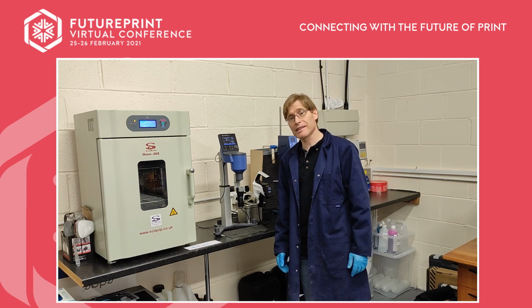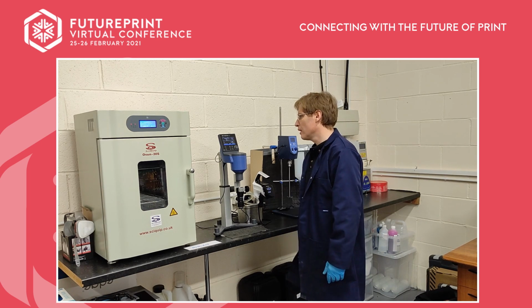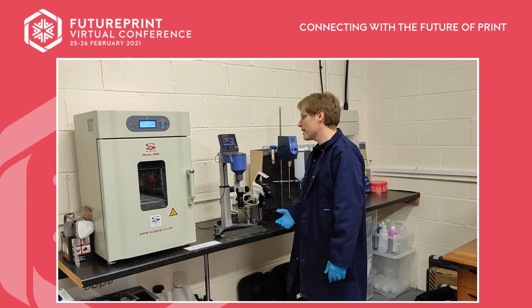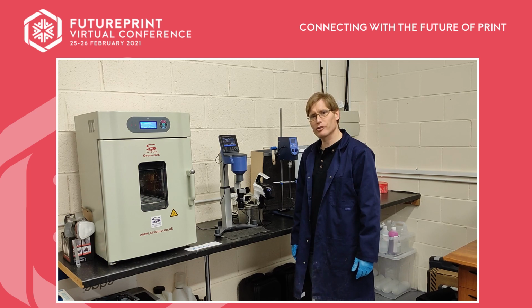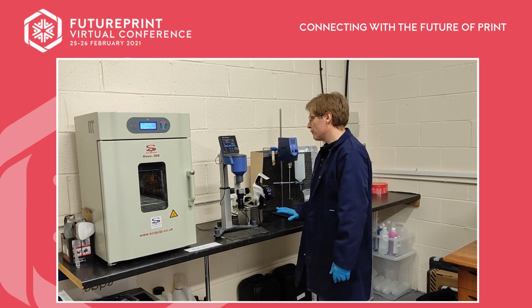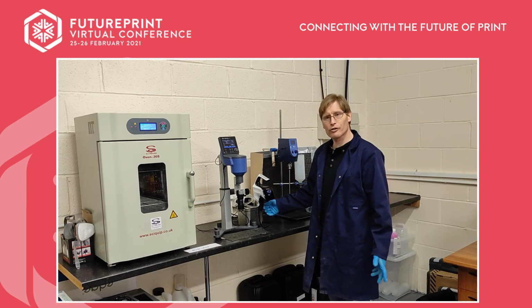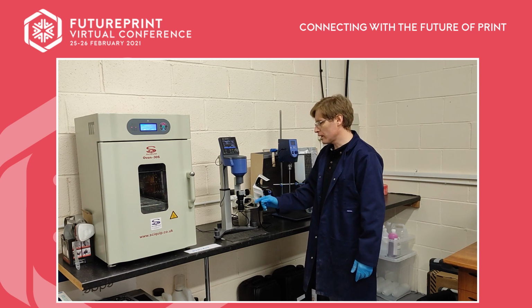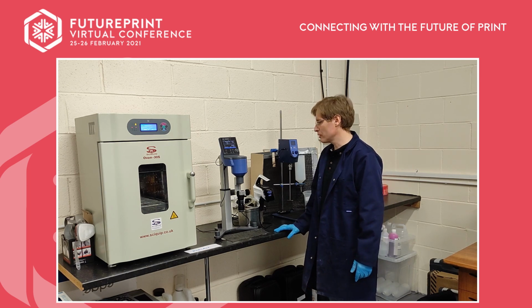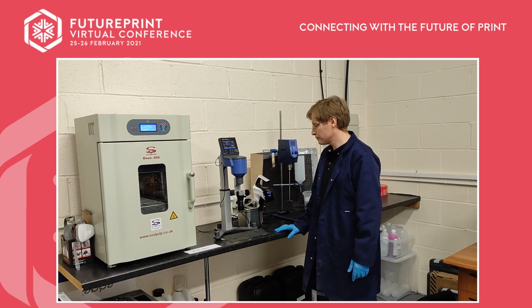As a part of the ink testing of that, the viscometer is very important. So we've recently upgraded to the ICA viscometer here. Currently we're measuring the Agfa ink that we'll be showing on our Meteor-based system later. And the temperature is 45 degrees C. As you're controlling the temperature through this lower cost water bath alternative, working through this low sample size, extra low viscosity adapter. So we need less than 20 millilitres to make a viscosity measurement. And at 45 degrees C, we're getting a viscosity of 10 centipoise.